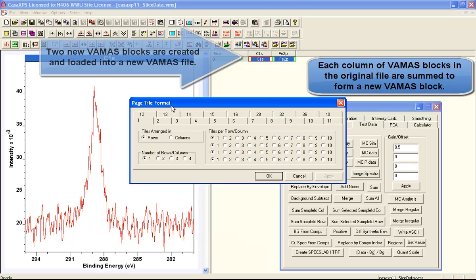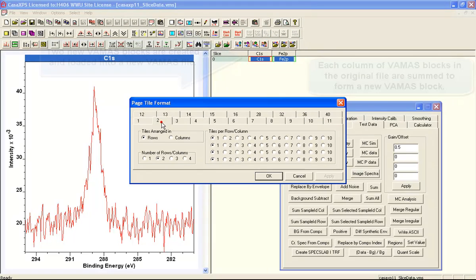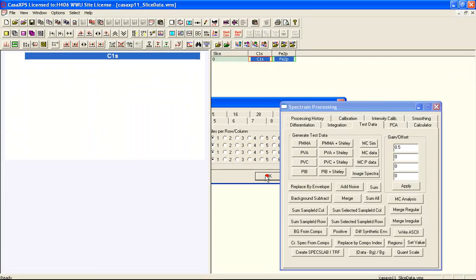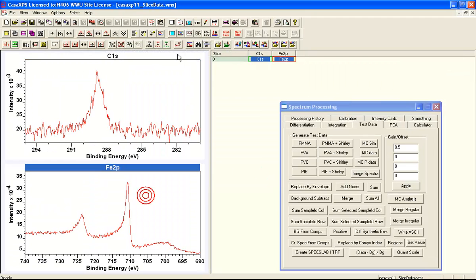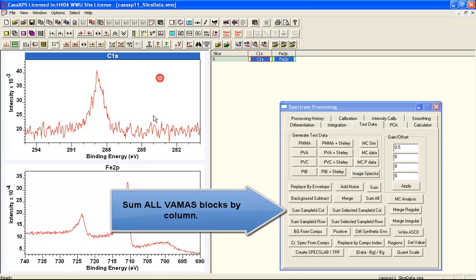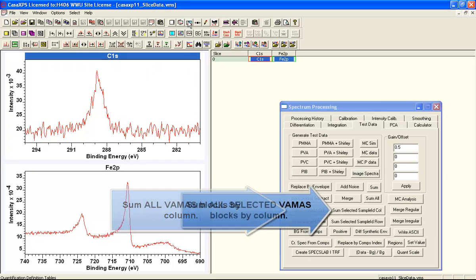Although the individual VAMAS blocks are low signal to noise, when we add them together we end up with two spectra that you would typically find for carbon 1s and iron 2p.